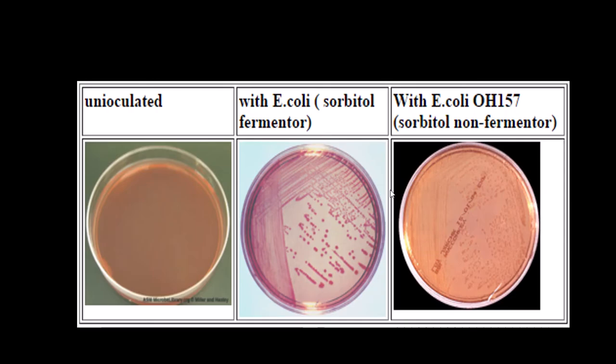Some of the media that we could be using to isolate the O157 strain of Escherichia coli contains the sugar sorbitol.